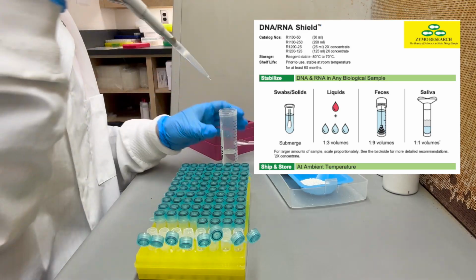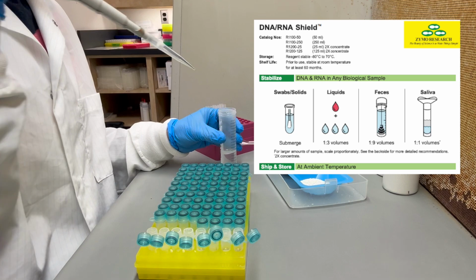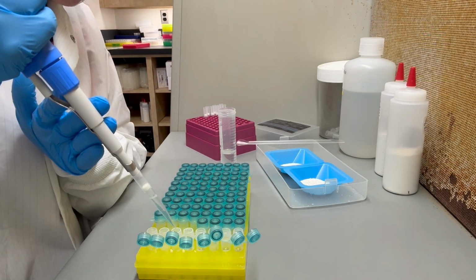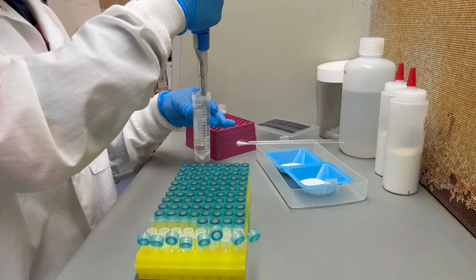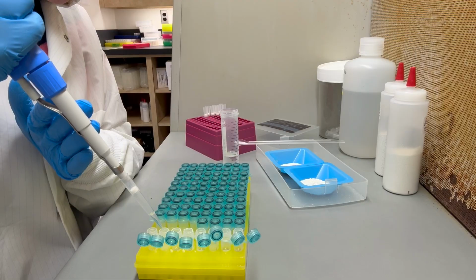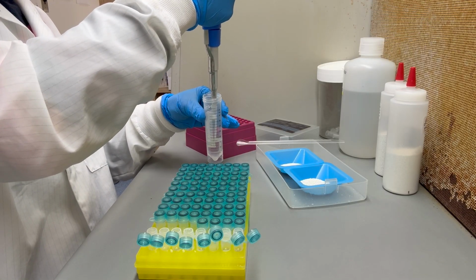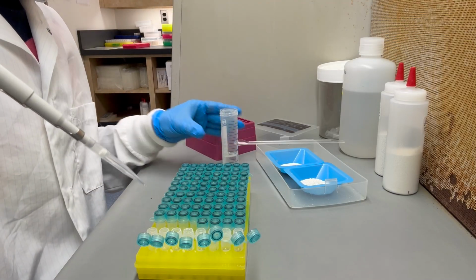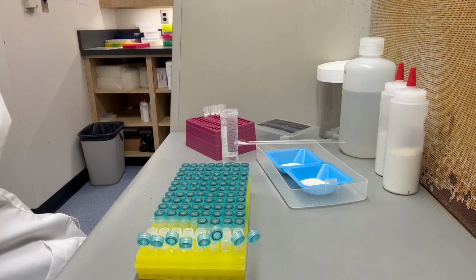And I really love this buffer because not only does it allow you to store your samples at room temperature, but it's compatible with DNA extraction methods. So you don't have to worry about removing the buffer from the sample once you get back from the field, like you would if your samples were stored in ethanol or RNAlater. So I would highly recommend adding your DNA RNA Shield to your screw cap tubes before you go to the field.